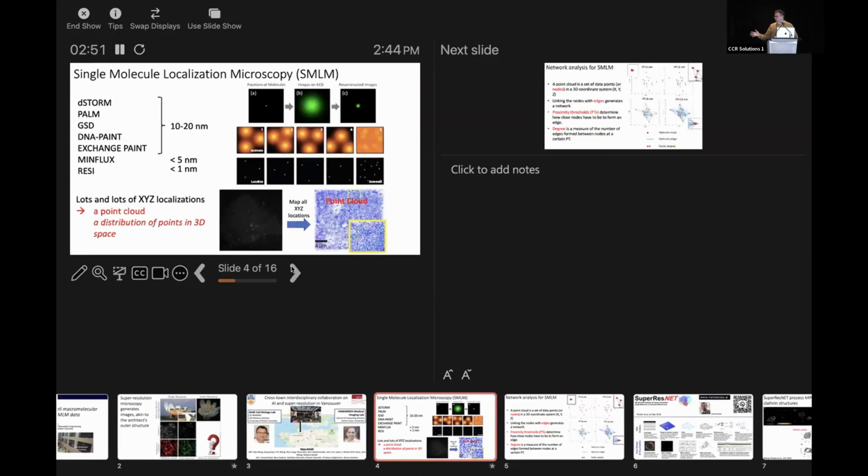I'm going to talk to you about SMLM. I do not need to introduce SMLM. AK has done a great job. But what I will say is that D-storm, PALM, GSD, DNA-PAINT, MINFLUX, RESI, these are all single molecule approaches. I'm sure you've heard the names. What they all do a little bit differently, but what they all do is generate, as Yuri said before, lots of XYZ localizations, and this can be millions.